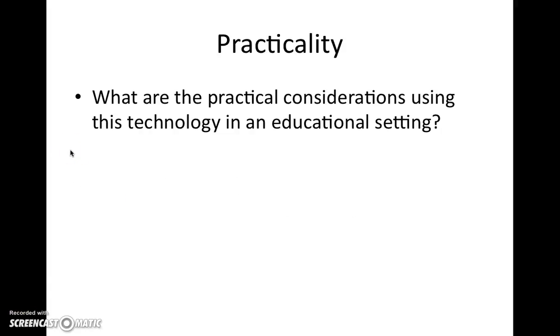And finally, what practical considerations are there for using this technology in an educational setting? Well, there is a bit of a learning curve as to how to use the virtual lab. It takes a bit of playing around to get an idea of how you're supposed to do things like pour chemicals from one vessel to another, how to weigh things out, those sorts of things. Also, when you're going through, you need to remember that you need to take actual physical observations in a lab notebook. You can't just assume that the computer program will do it for you. I made that mistake myself when I was going through. Otherwise, I don't see any huge drawbacks.